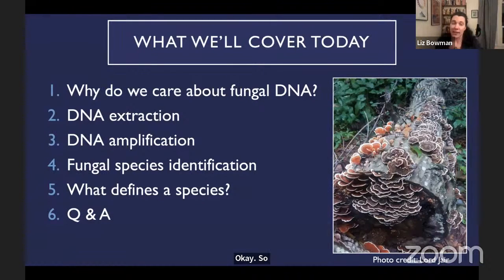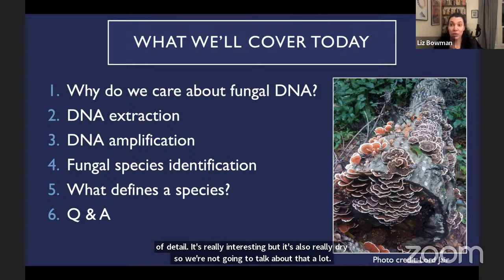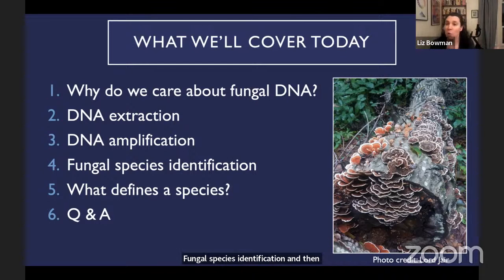So what we'll cover today is, why do we care about fungal DNA? Why can't we just use physical characteristics? That's called morphology. What is DNA extraction? What is DNA amplification, where we make multiple copies of DNA? We'll touch on sequencing. I'm not going to go into a lot of detail. It's really interesting, but it's also really dry, so we're not going to talk about that a lot. Fungal species identification, and then really what defines a species. And then we'll have more time at the end for any questions I'm not able to get to.